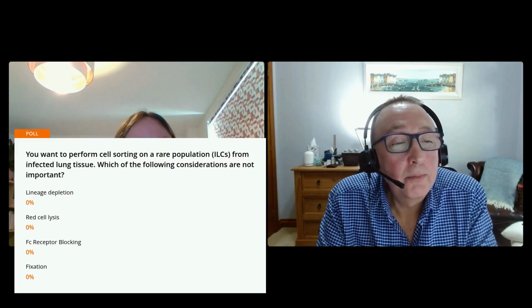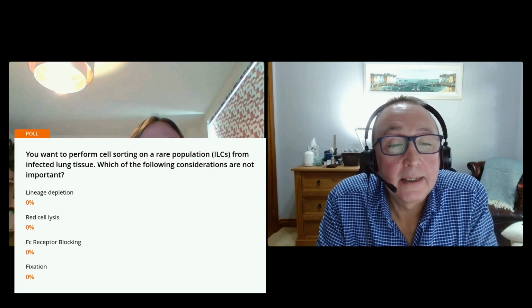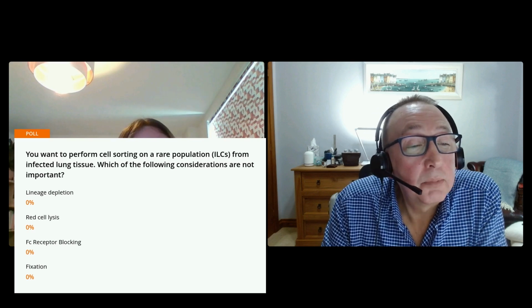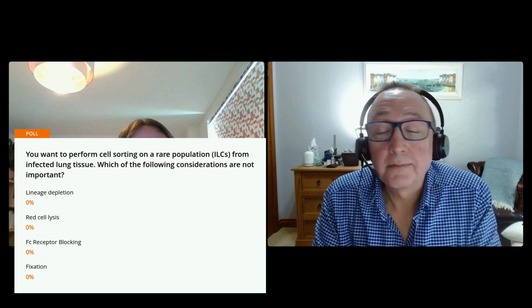Okay, great. On to poll number 4. You want to perform cell sorting on a rare population, ILCs, from infected lung tissue. Which of the following considerations are not important? Lineage depletion, red cell lysis, Fc receptor blocking, and fixation. And while you're answering that, we'll go to the next audience question.